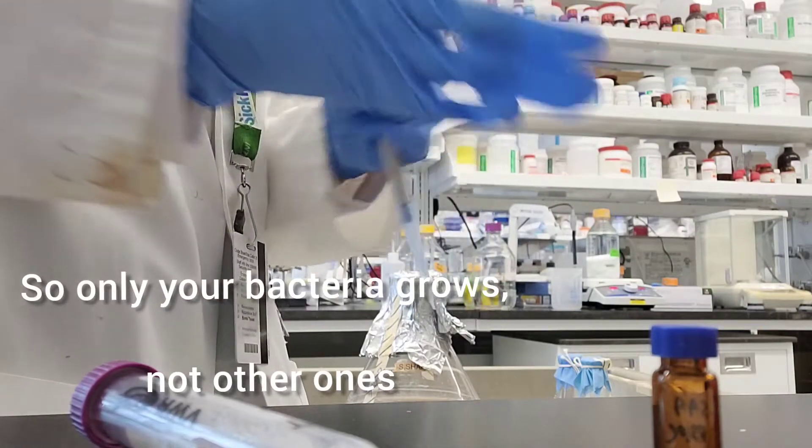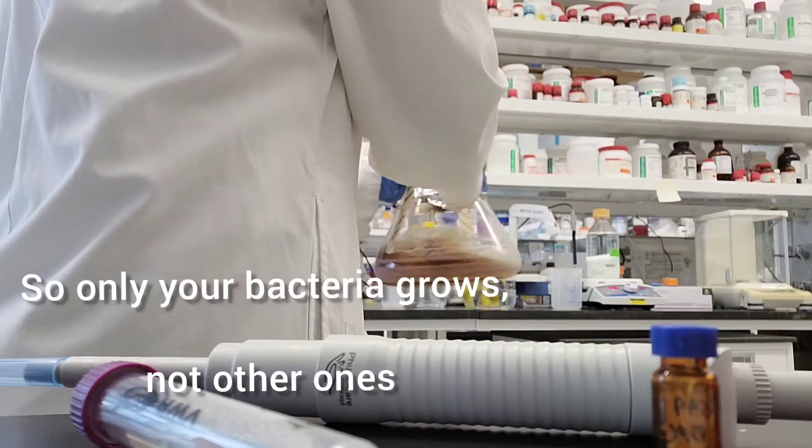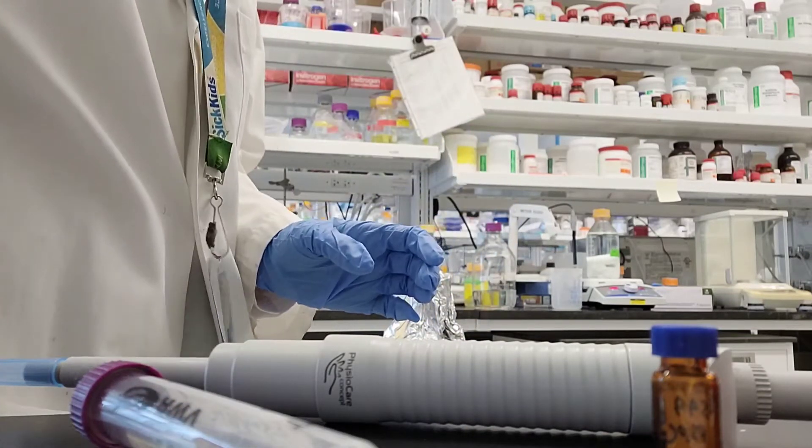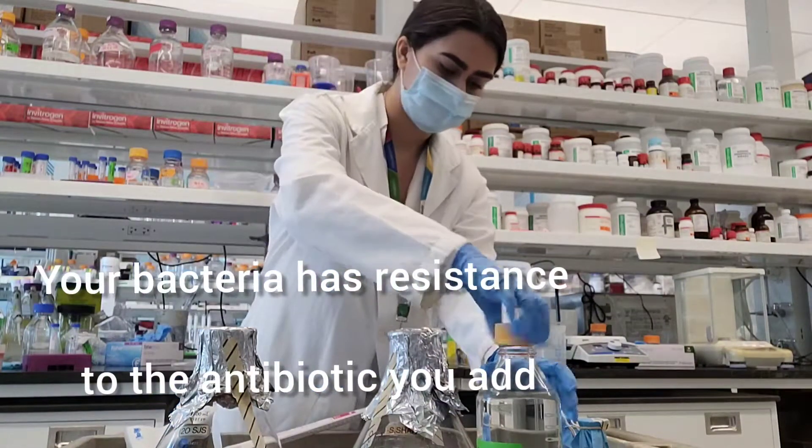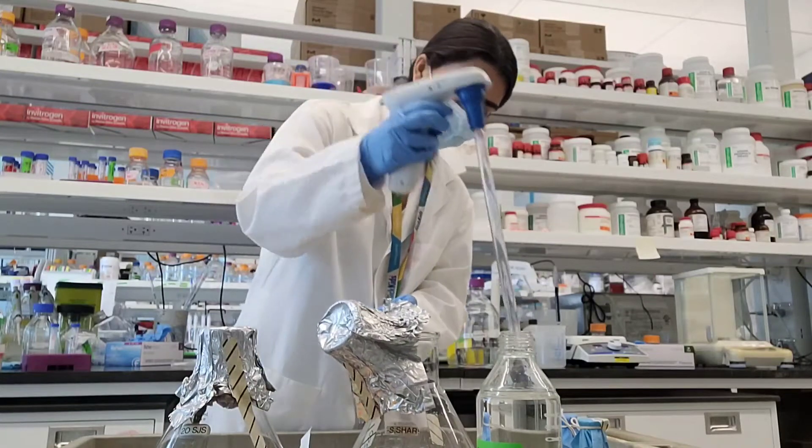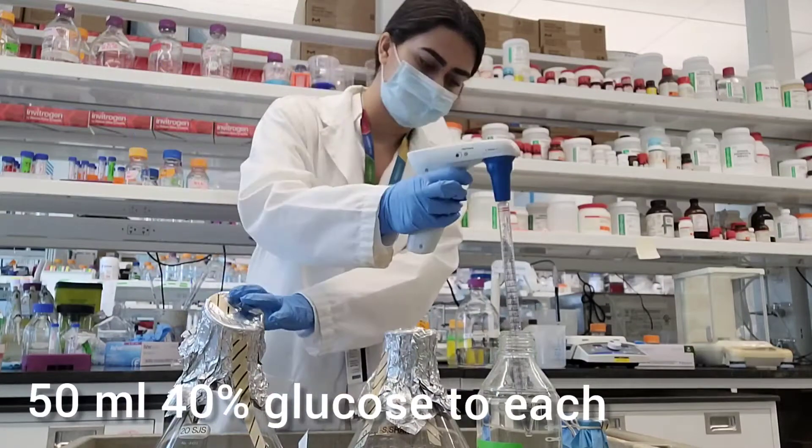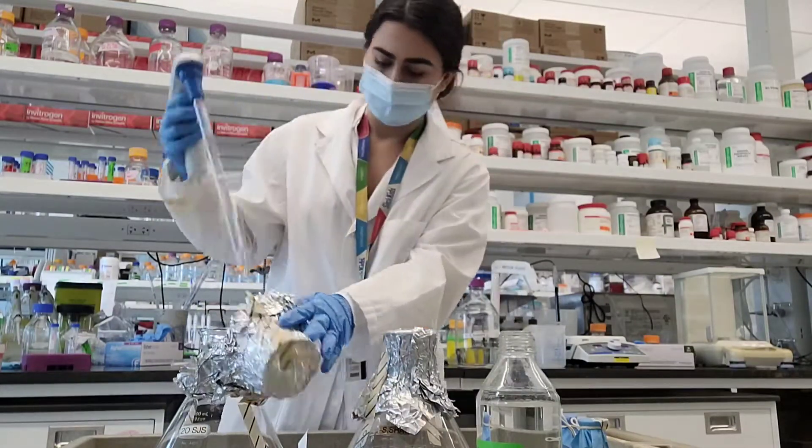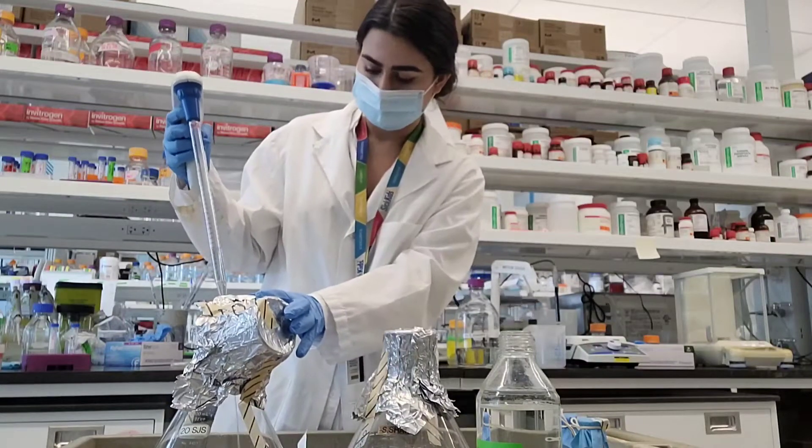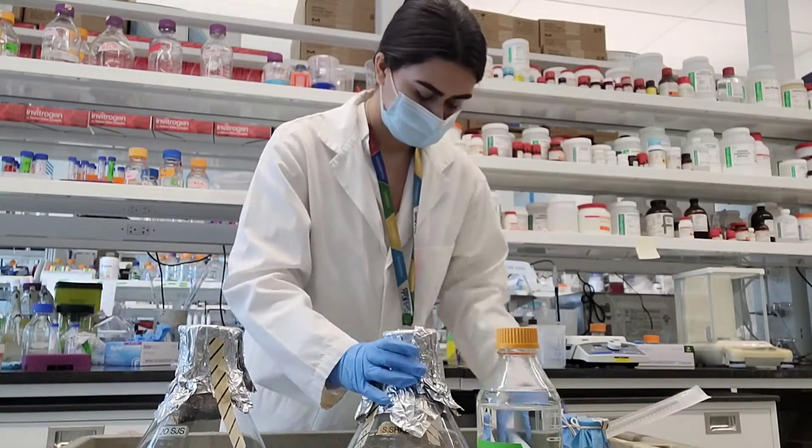The antibiotic will make sure that only your bacteria is going to grow and not the bacteria that is present in the surrounding air or anything that might accidentally get in there. You only want your bacteria to grow. Now I'm adding 50 mils of the 40% glucose to each one liter flask because they need sugar as a food source as well.